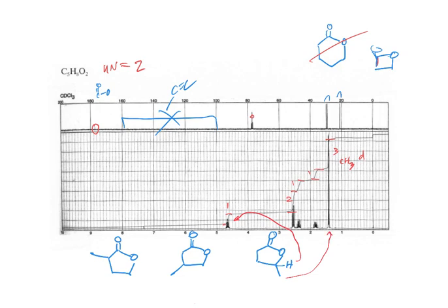What's happening with those other protons? We have 2 here and 2 here. We've got to account for them in these peaks right here. The two singlets are the ones attached to the carbonyl carbon. Well, not attached, but alpha to it. You mean these peaks here? I don't think they're really two singlets. No, I mean the two single proton peaks.